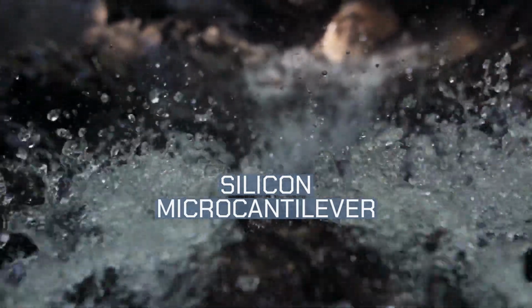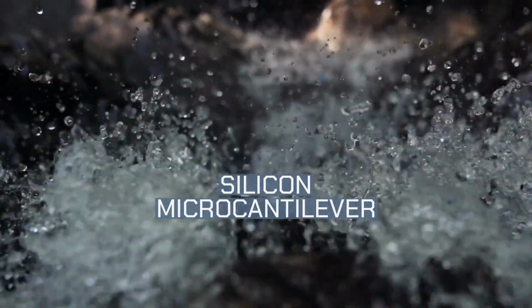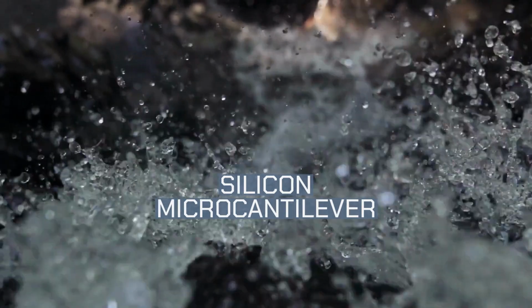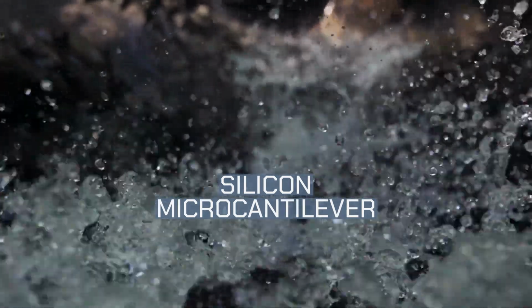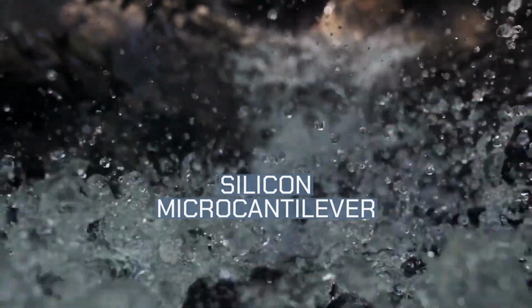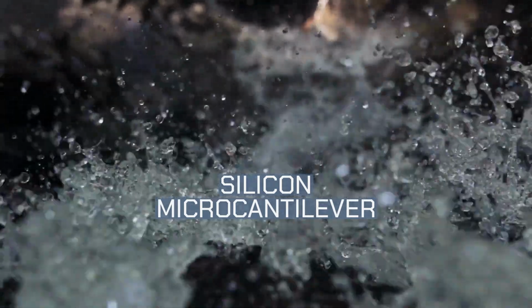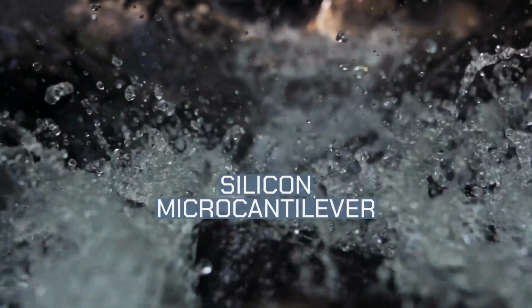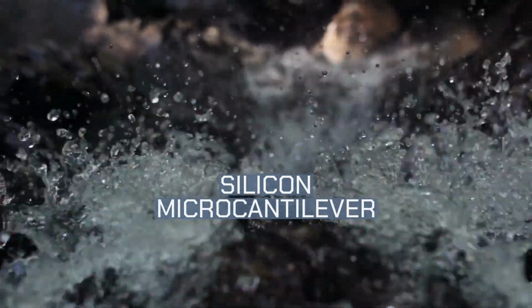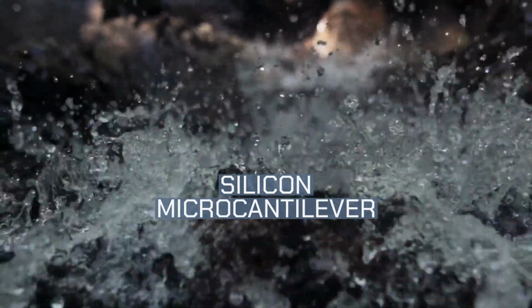nc-AFM cantilevers tend to have higher stiffness and resonant frequencies than contact AFM cantilevers. The reason for the higher stiffness is to stop the probe snapping to contact with the surface due to van der Waals forces. Silicon microcantilever tips can be coated for specific purposes, such as ferromagnetic coatings for use as a magnetic force microscope.